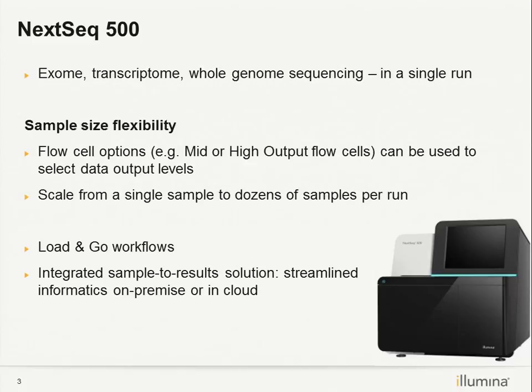Because in the cloud, the advantage is that it's not only doing the demultiplexing and FastQ generation. With the final FastQ files, you can launch the apps in the cloud. For example, for RNA sequencing, you can use the Illumina RNA app with the TopHat and Cufflinks analysis algorithm, or for exome, maybe you want to use the BWA enrichment or ISAAC enrichment workflow, which is more like secondary analysis, annotation and all those.